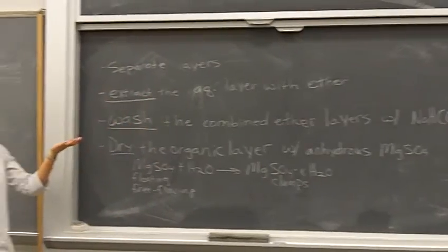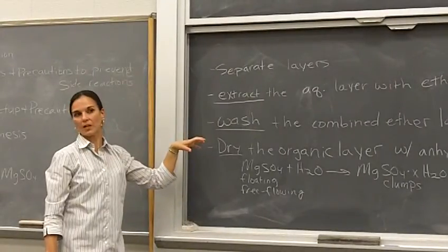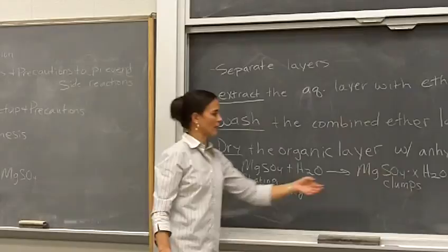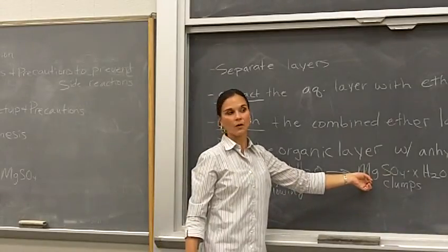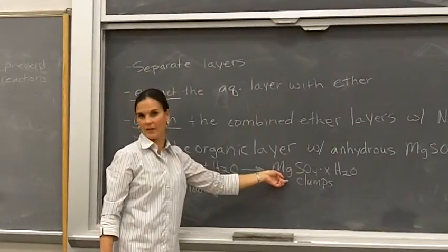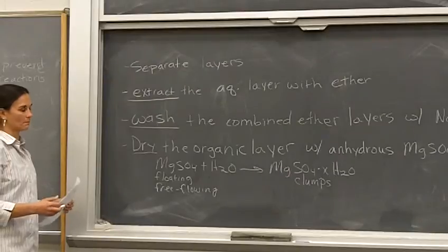That magnesium sulfate and filter paper, let it air out in your hood, and then put it in the waste bucket that's in the reagent hood, both the filter paper and the solid, okay? Because this solid, is it organic or inorganic? Inorganic, so does it go in organic waste? No. No magnesium sulfate in the organic waste, okay? So the filter paper and the magnesium sulfate go in the waste container, okay?